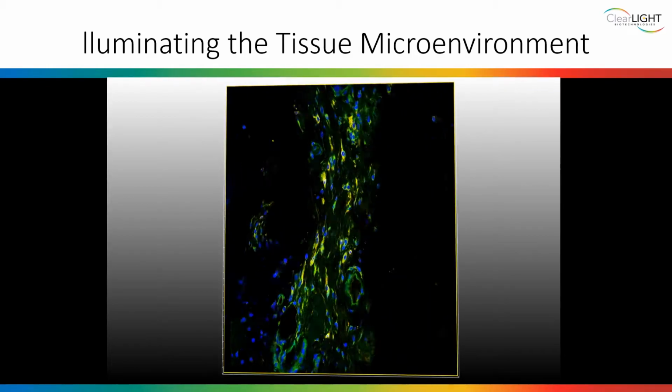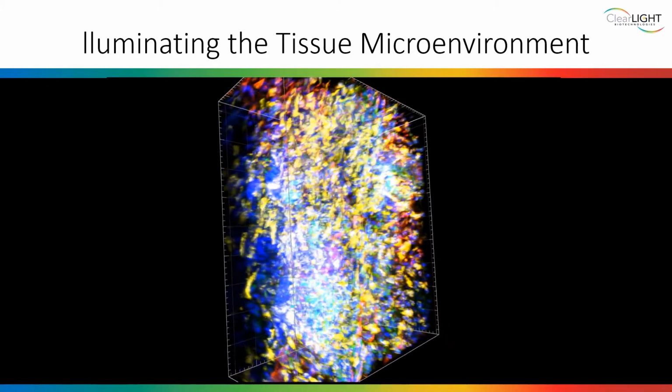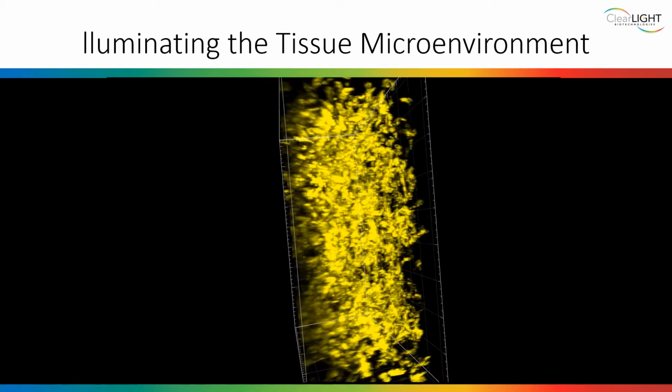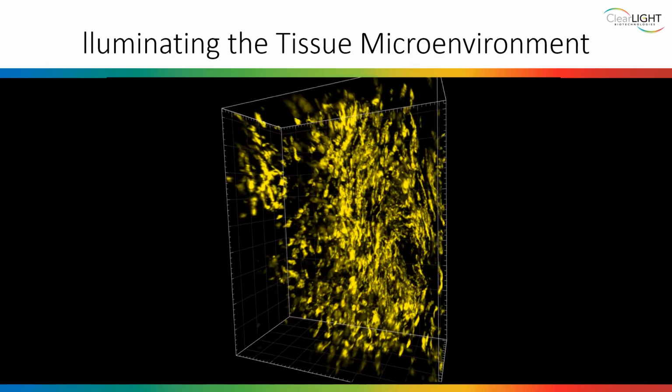The see-through tissue clearing process can be integrated into a normal tissue processing workflow and be complementary with current 2D FFPE technologies to further empower researchers involved in preclinical and clinical research studies to see more biology.